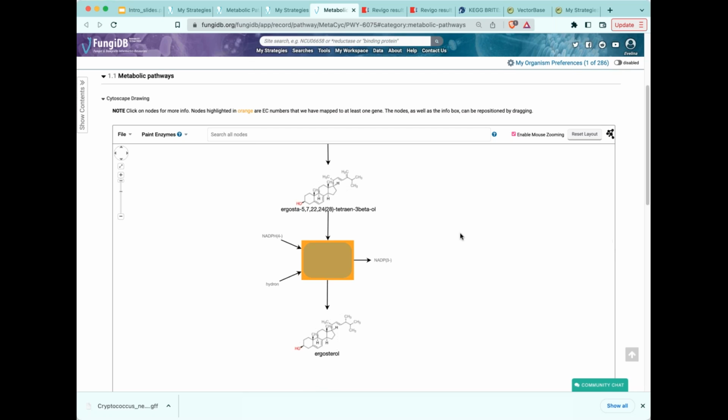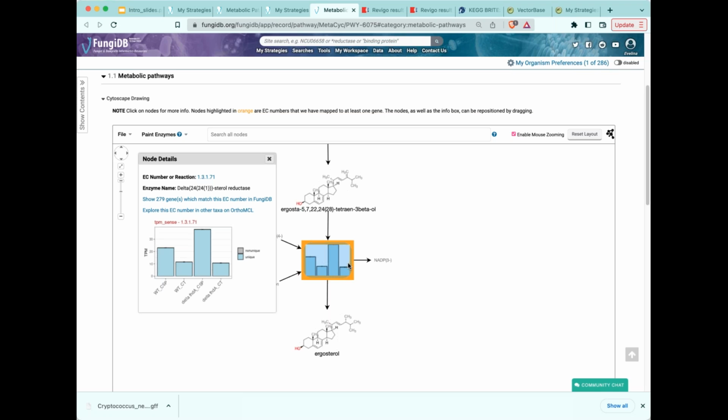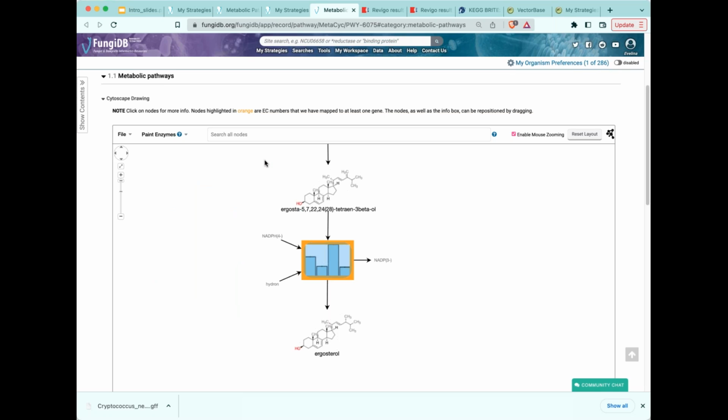Now within Cytoscape, when the window refreshes, you will notice that we have a different view. What the view is showing you is how this gene is expressed in Aspergillus fumigatus within the 4 different samples that I looked at when running my RNA-seq analysis. And this is quite useful because you can really quickly glance at how individual nodes or particular genes behave within different experiments. Right. And now I'll switch gears and move on to a different database.